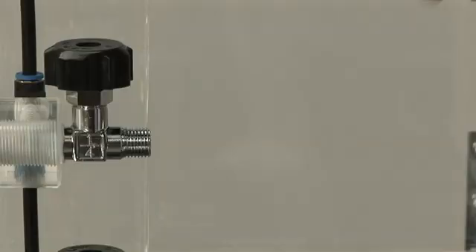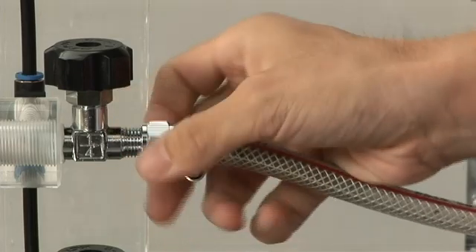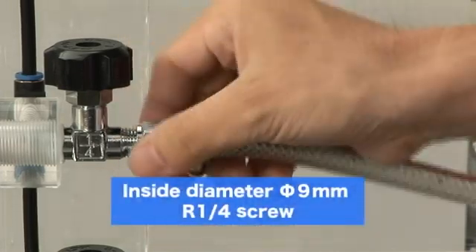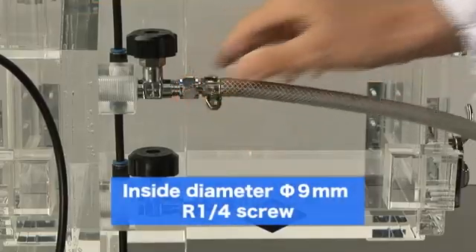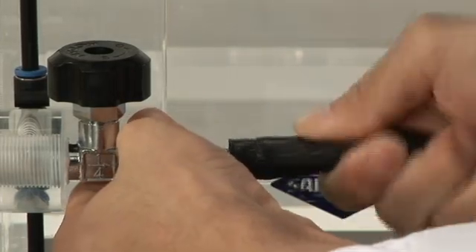Connect each piping to the vacuum valve. According to the inlet shape, choose a resisting pressure hose which has an inside diameter of 9 millimeters and a quarter inch radius screw for the vacuum pump.